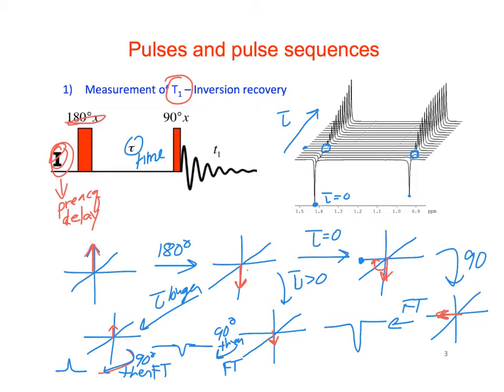So what we do then is we graph this. Each one of these lines is with a different tau value, and we have a tau and an intensity value for each one of these. Because we have 2 peaks, you're showing 2 different lines. Right, there's a different line, because notice this one relaxes faster than this one does. So it's just for the 2 different species. In fact, if you had a more complicated spectrum, you could have a different T1 value, a different relaxation rate, for each of the signals in the spectrum.